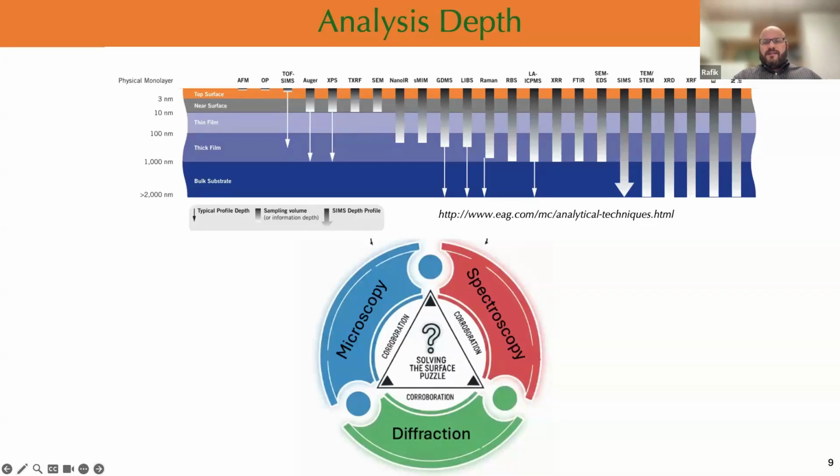We need to look at surfaces and interfaces where every atom counts. And no single tool exists that can give you the full answer or the full picture. So to solve the puzzle, we need a combination of microscopy, spectroscopy, and diffraction techniques.